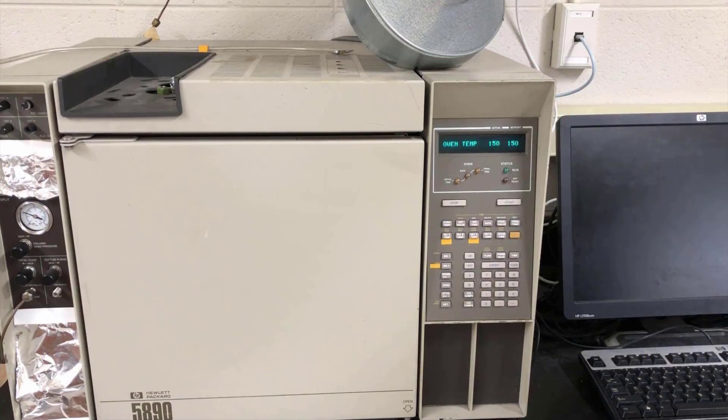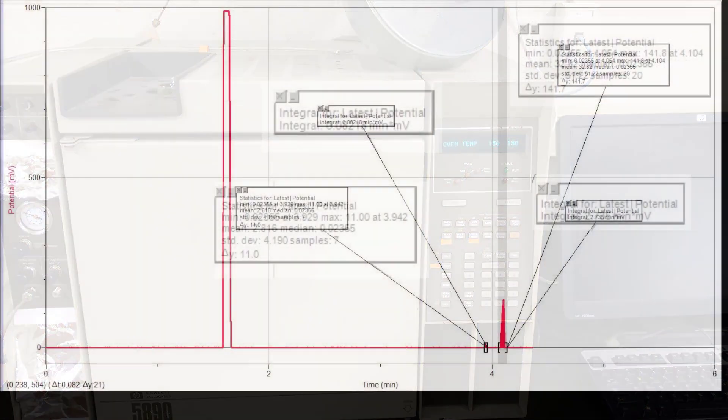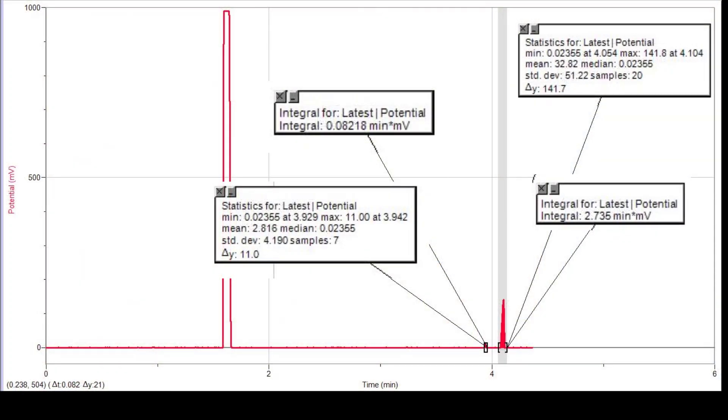Finally in this experiment, we'll be analyzing the product mixture by GC, gas chromatography. This is a technique that was described extensively in a previous video as well, so you should check that video out for reference if you haven't seen it or don't remember how to do it. I'm just going to provide the data here, which is a chromatogram of the reaction mixture with peaks labeled with retention time and integration value shown.